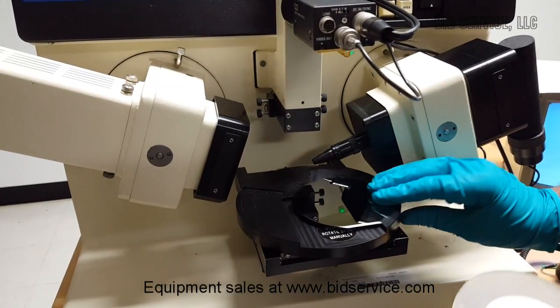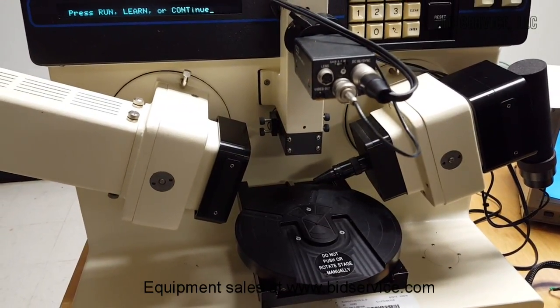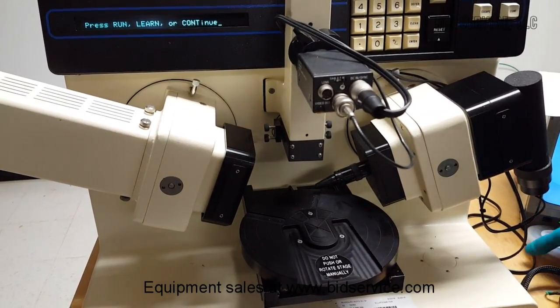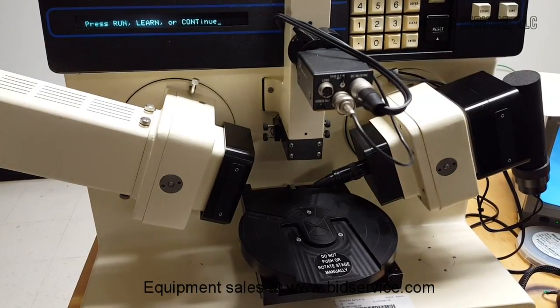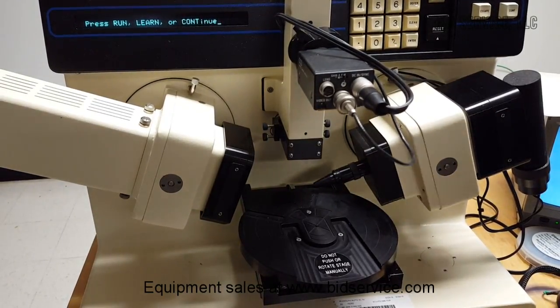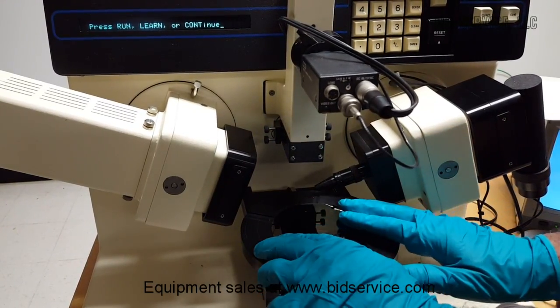The system also measured the standard deviation and average parameters for 5 measurements. So now I'm going to change the sample to a 9,000 angstrom sample.